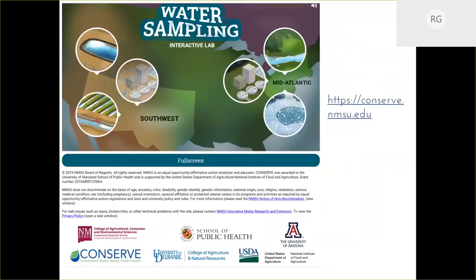I'm lucky enough to work on CONSERVE, which is a center of excellence at the nexus of sustainable water reuse, food, and health. As part of CONSERVE, with our collaborators at New Mexico State University, we've created this beautiful water sampling interactive lab, which I'm showing you on this screenshot. This water sampling lab takes you through step by step exactly how water sampling should happen. It also introduces different scenarios of animals being nearby or other things that might happen in different situations that you need to take into account.